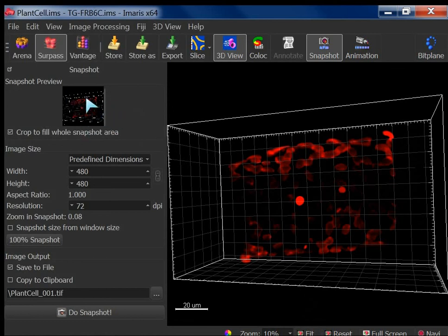However, the scale bar isn't still there. I think it is there. It's just that it's very small, that's why. But you can move it. Of course you can move it, I showed you, right? Yeah, I like that. You can put it anywhere.